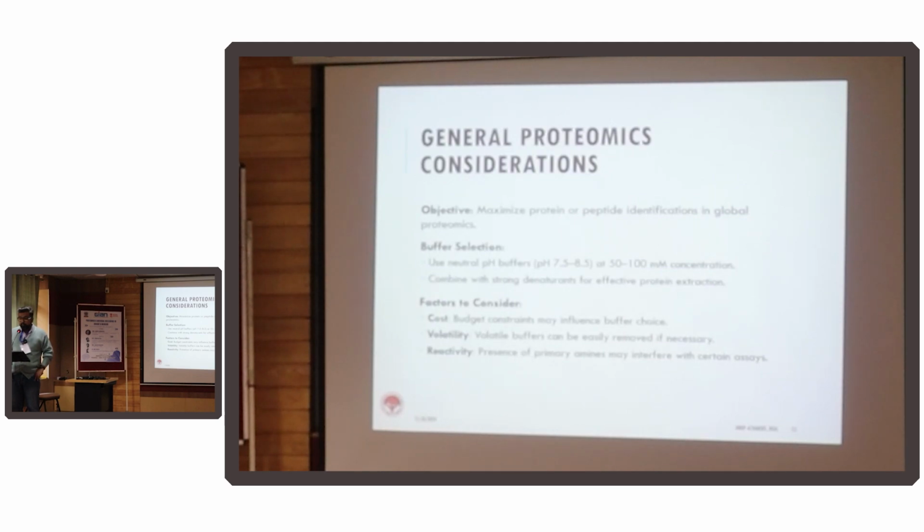Primarily the cell is very robust, right? All the proteins are there in their own place. They won't want to break off. Since they don't want to break off, you have to use some agents. We also call it a chaotropic agent, so that induces a lot of chaos, and the proteins will break down.